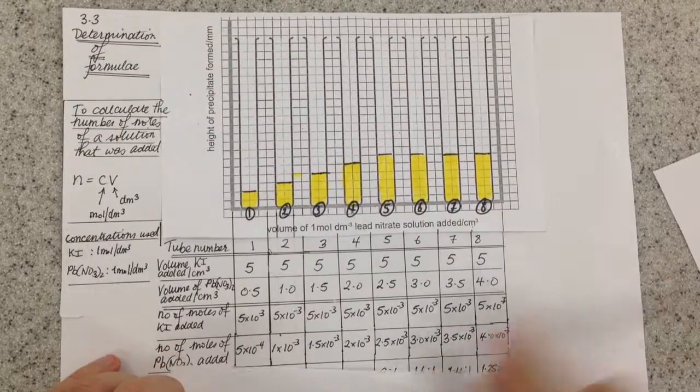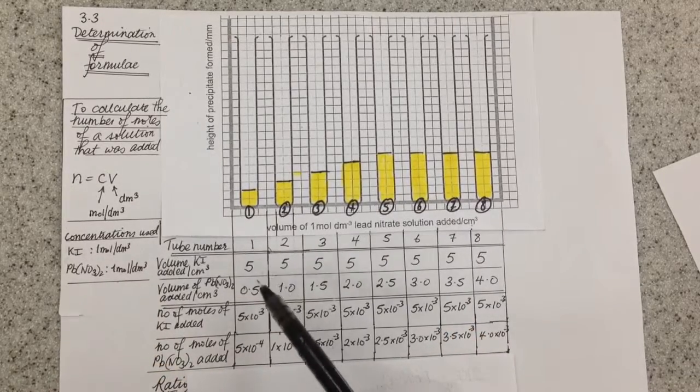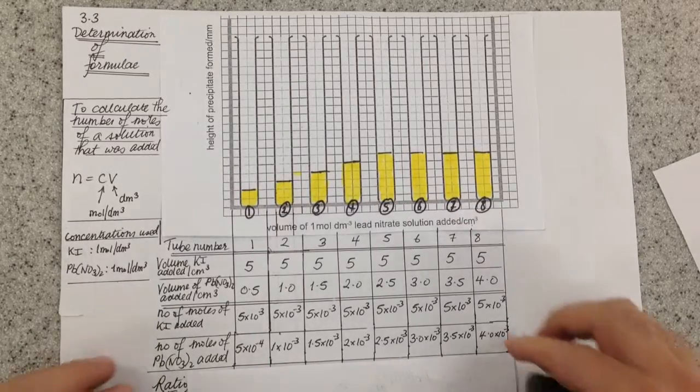What we then did was we then changed and increased the amount of lead nitrate we added each time from 0.5 centimetres cubed up to 4 centimetres cubed in the final tube, and using n equals CV again, we worked out the number of moles of lead nitrate that we added, from 5 times 10 to the minus 4 moles up to 4 times 10 to the minus 3 moles.